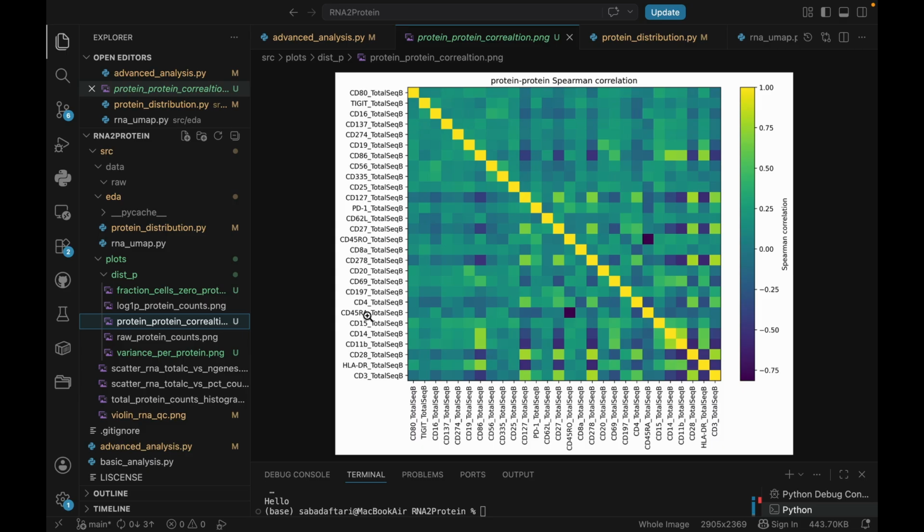But what does this tell us in general about our model? What can the model predict? First, the strong positive clusters can carry redundant information, so predicting one of them helps predict the other. Second, for the strong negative pairs, the model needs to learn opposite patterns, right?